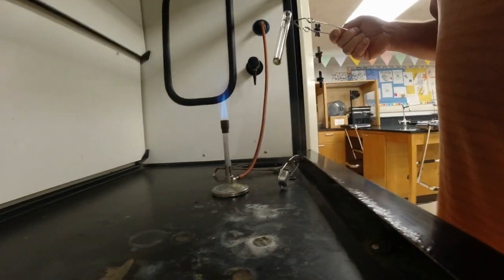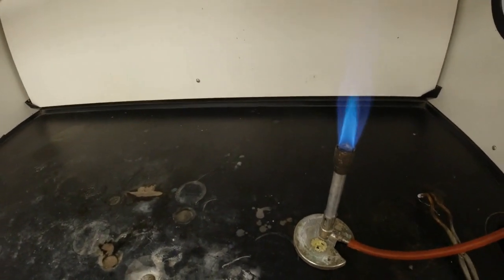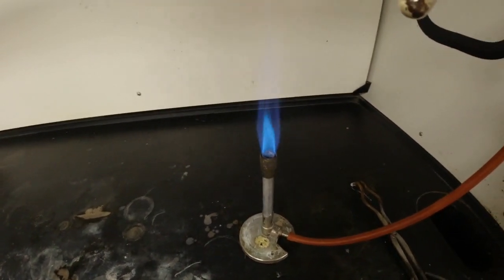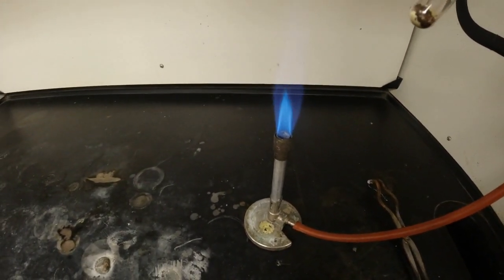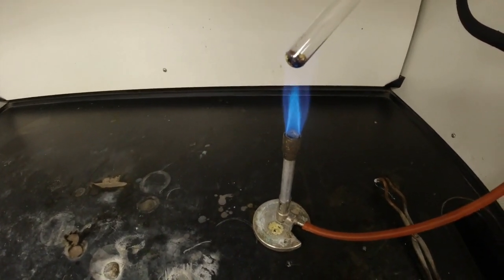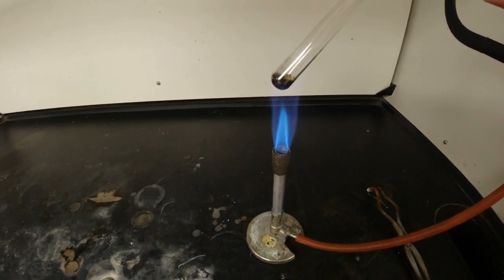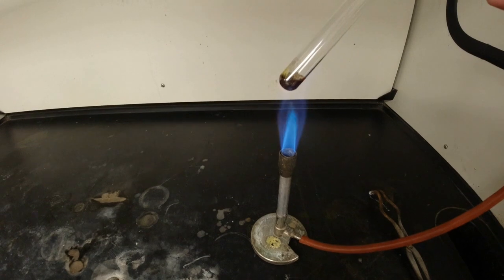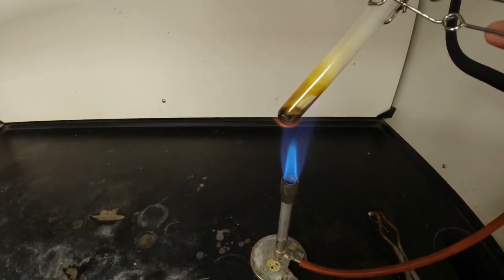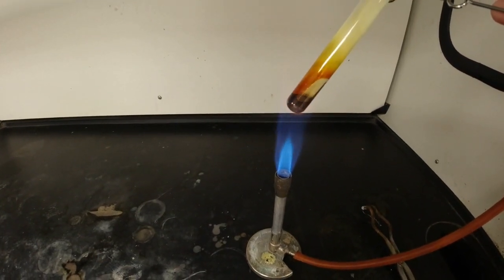What I'm going to do is heat this iron sulfur mixture in here. The reason I do this in the fume hood is that it's going to produce obnoxious fumes, and we also don't want to set off the fire alarm. So I start heating this, and immediately it looks like there's a change taking place. Things are looking bubbly, and there's some smoke coming off of it. Some of the sulfur seems to be melting, but inside, things are mixing together, blending in there.